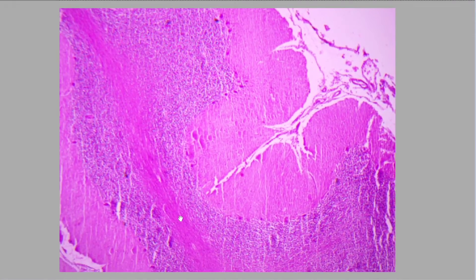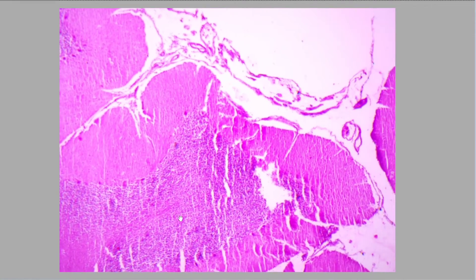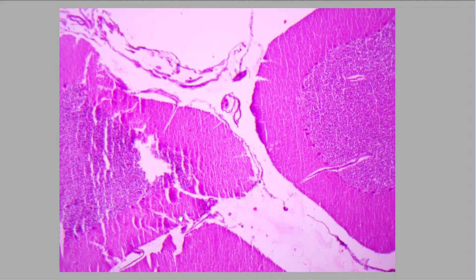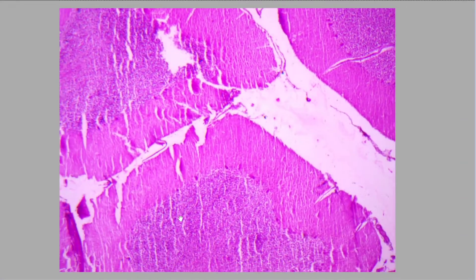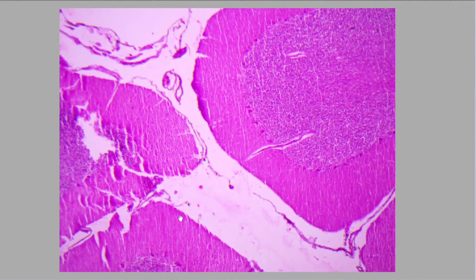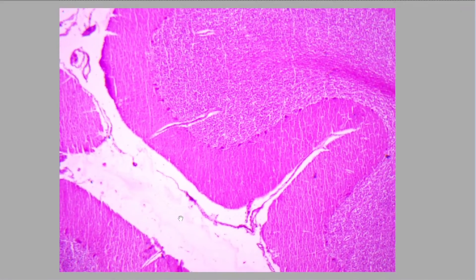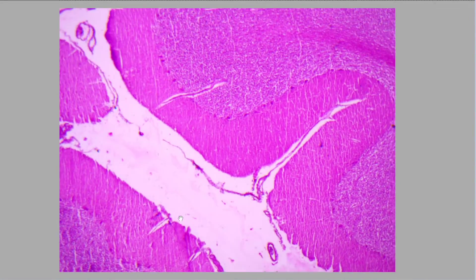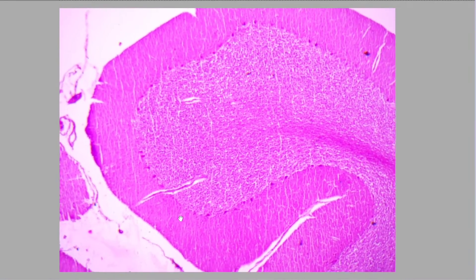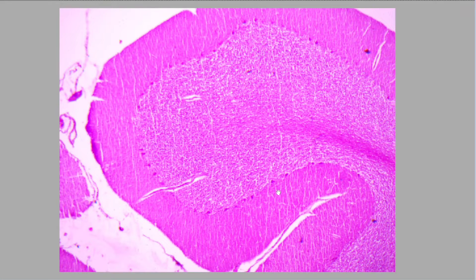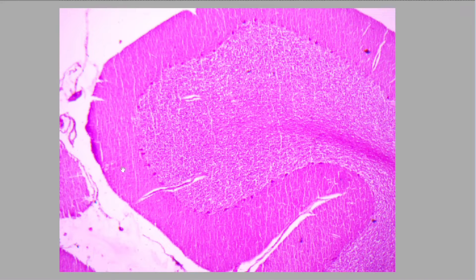When you have the cerebrum, the folds are known as sulci and gyri. But in the case of the cerebellum, they are larger and they are known as folia. You can see that these are the projections, and in between the projections, these depressions are present between the adjacent two folia.